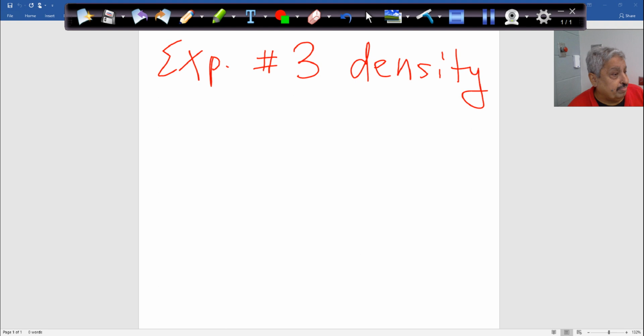with verniers. Remember the stainless steel balls? Those are different from what we are doing today. Today we will be doing the density of some liquids and some solids, okay? And some of them are in a powdery way, some of them in a metallic way, correct?